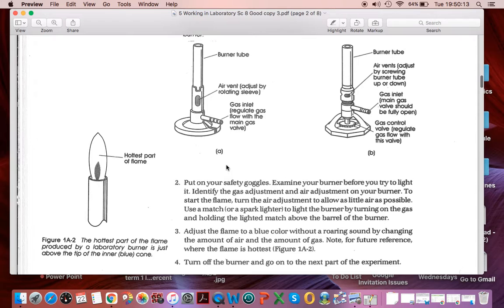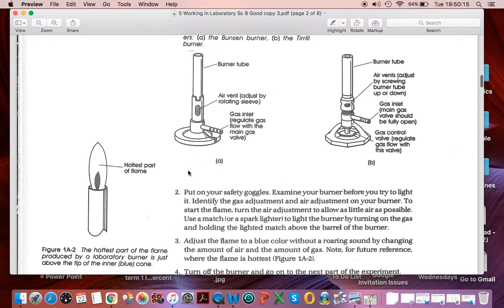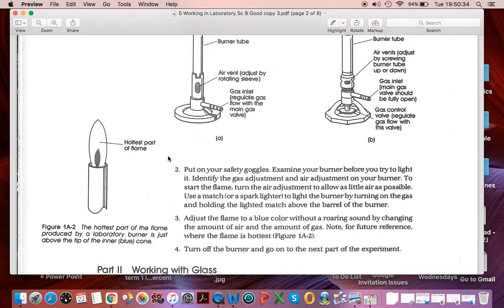Now, before we light a burner, of course, we want to make sure our hair is tied back if it's long, and we want to make sure all flammables are safely away. On one side of the room, we have to be careful not to put our burner under the cabinet, so we can light up the cabinets. So, make sure your surroundings are safe. Make sure you're wearing safety goggles, and your clothes and things are appropriate. If anything goes wrong, once you light a burner, you turn it off at the tap.